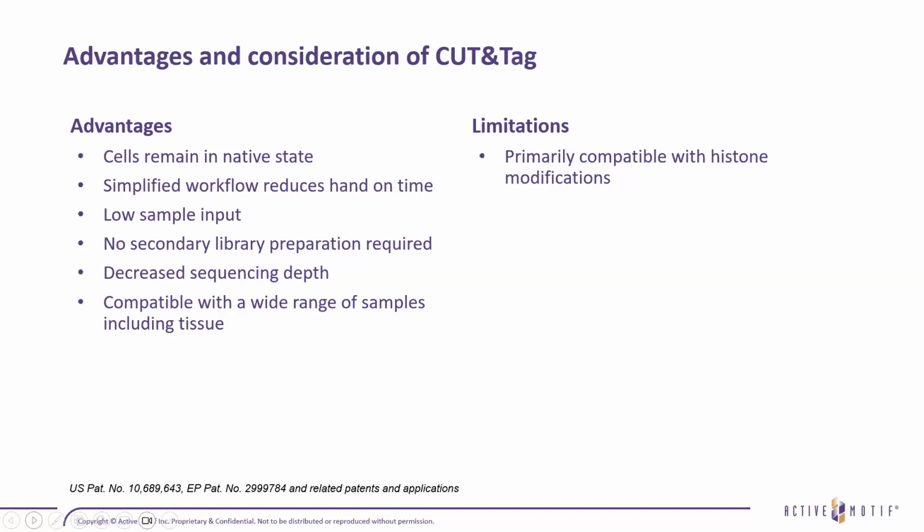Limitations here is the primary compatibility with histone modifications. This method, like I said, it does work with some transcription factors, but really you're targeting histone modifications if you're using this method.